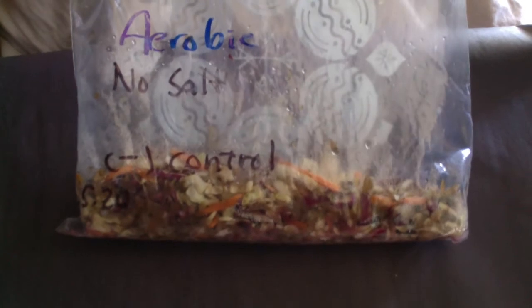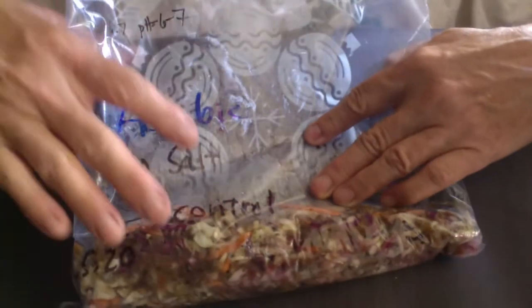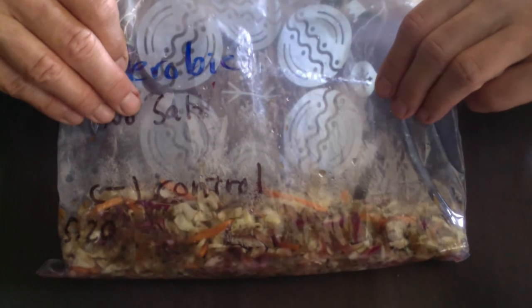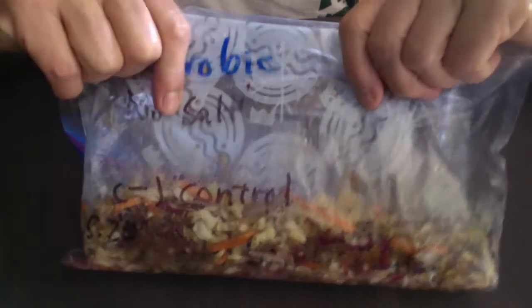Now it's day five, and I wanted to show you the appearance of the cabbage. This is our negative control — no salt, aerobic. You can see that the cabbage is starting to oxidize and rot. It's turning brown, probably getting a little bit slimy. As humans, we probably wouldn't want to eat this — not very appealing. We'll do some culturing to see what kind of microbes are growing in here. It does smell like there's some lactic acid fermentation going on in there, so we probably have a mixed microbial community and some of the cabbage is starting to rot.